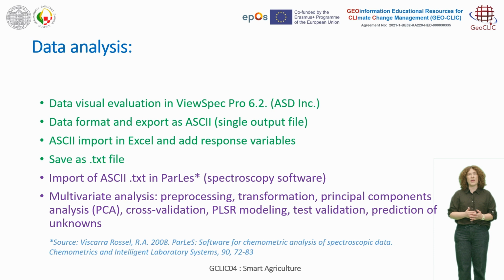You also will have a possibility to see the Excel file where the data is structured and ready to take TXT files as input to spectroscopy software for multivariate analysis. When I sort the data, I save it as a TXT file. What I will do here in the demonstration, and what you'll do, is to import the ASCII in Parles, spectroscopy software developed by Viscarra Rossel 2008.